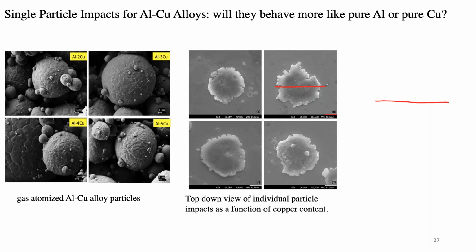Have you tried broad beam ion polishing at all for cross section? I have not, because I don't have a working broad beam ion polisher, but I would love to try that, and I think that could probably work really well. In a couple months, we're going to have a plasma FIB here, and I'm quite hopeful that the plasma FIB will allow us to have some added gains as well. But yes, I think broad beam ion polishing would be a great way to try.